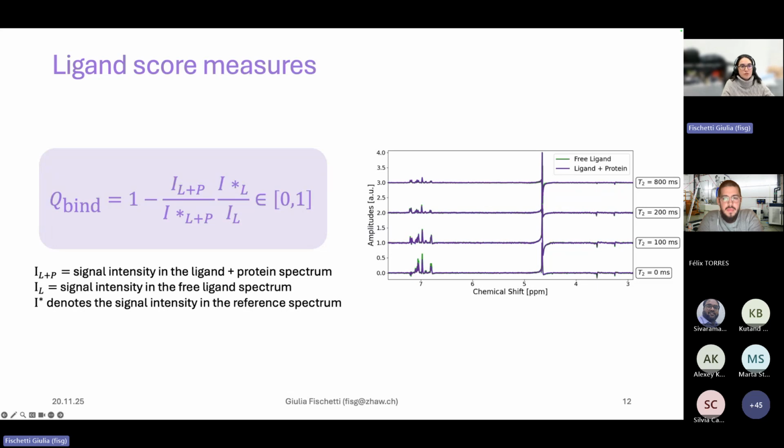We are considering also implementing or using the magnitude spectrum rather than the positive and negative or the real spectrum as input, but so far we are not using it. Definitely, including the multiplet splitting pattern or the sign could help the assignment.